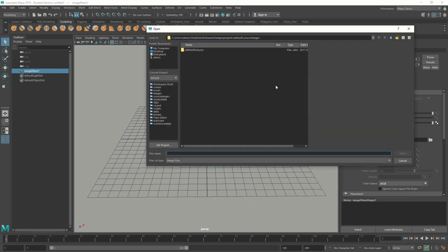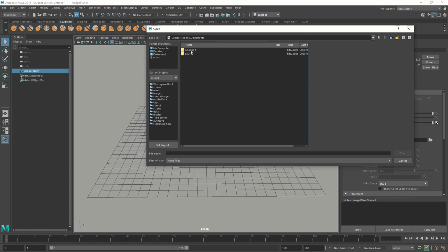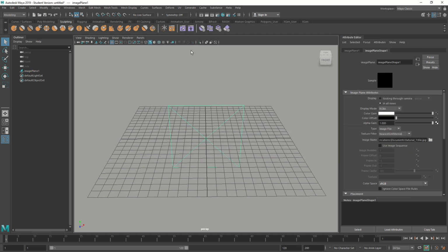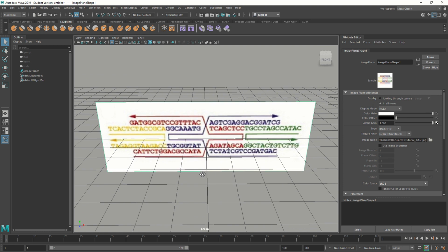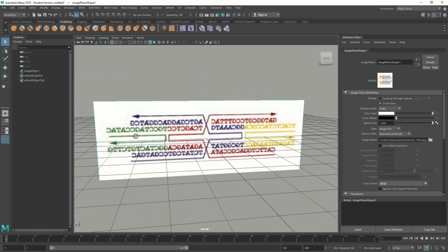So I click here. Then I go to my tutorial folder, where I've basically just saved the picture of the tile from the paper I was just showing you. And I'm going to import it here. And this will just be a nice schematic for drawing. And here, of course, it's important to see that you're not looking through it backwards, because then it gets mirrored.